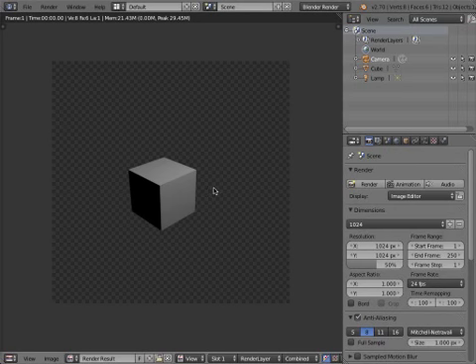And the reason is when you're making a figure later in Illustrator, you have an alpha channel and you can have overlapping objects. So just imagine you've got a render where one corner is empty. You can move things above each other and they're not going to block each other out, because there's just transparency there.